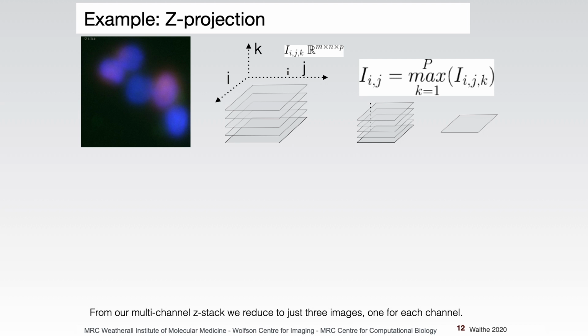In the normal way to apply it, you would apply it per channel, but the algorithm does that for you. So you don't have to say do it per channel. It will just give you, in this case, a 3-channel output. But it wouldn't matter if it wasn't exactly the same position in that 3D? No, the pixel, yeah, that's a good point. The pixel can actually come from different positions depending on which channel it's looking at. So that could be important. That's the sort of noise that you're introducing, and that could affect your experiment.